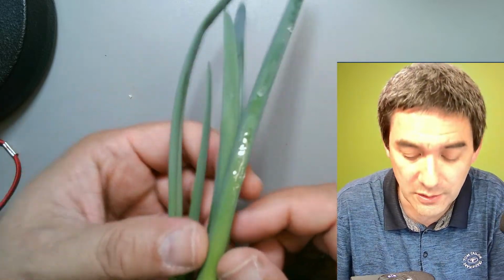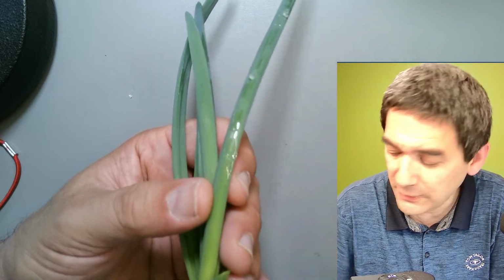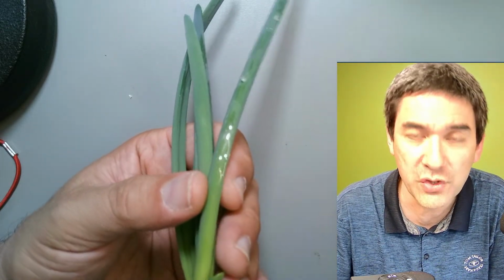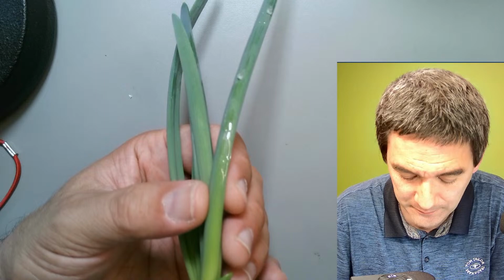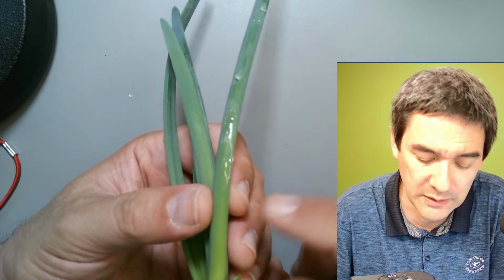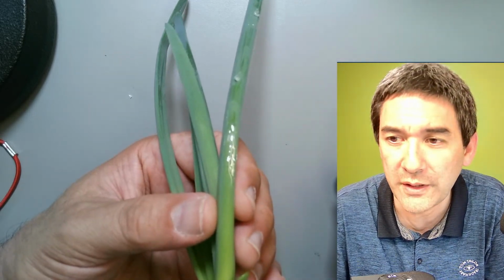What I've done here, and you can try this out as well, I've applied a little bit of glue on this onion here, and by peeling it off, you can actually put that under the microscope as well, and you should be able to see the surface structure. Last week I've already done this with an oak leaf. I've not tried it yet with a monocot plant like the onion, and I would like to see how the leaf structure here is different from those of the dicots, like for example of an oak tree.